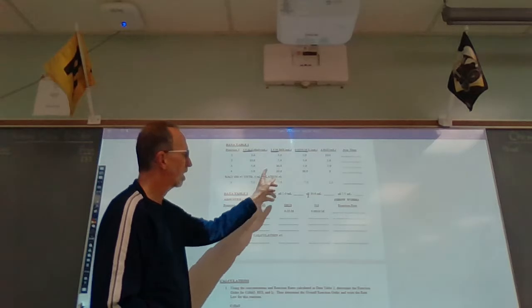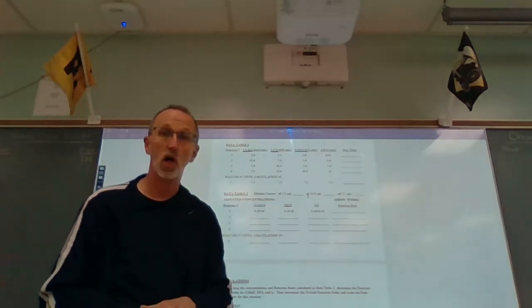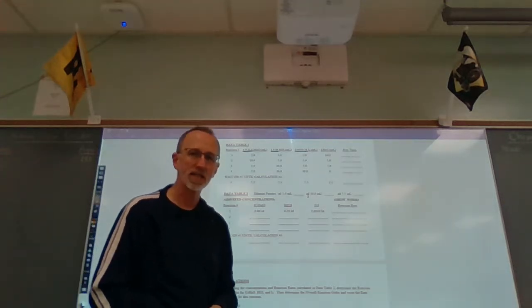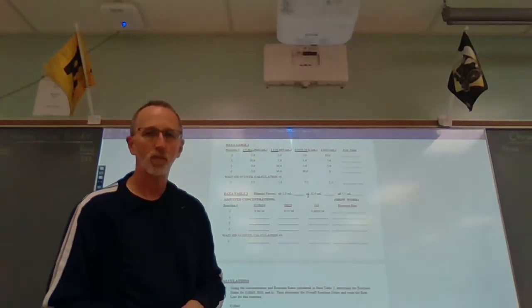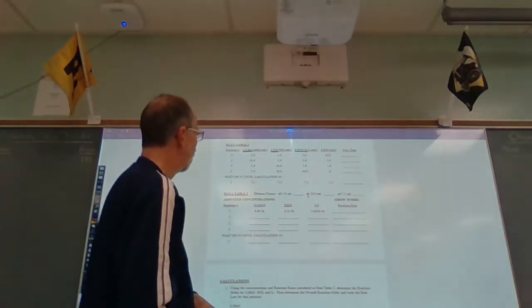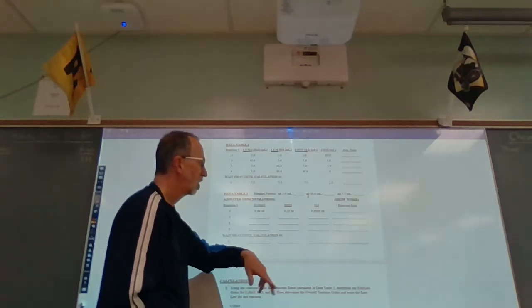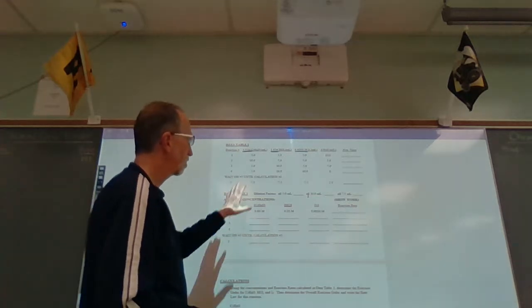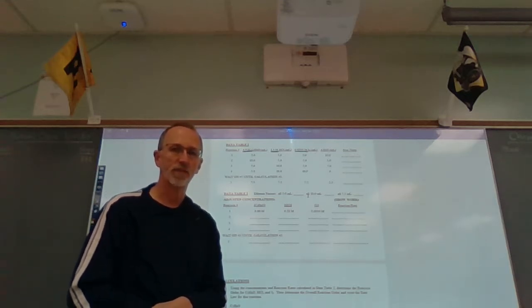We have varied the volumes of one of the reactants while keeping the other two volumes the same, and then use the appropriate amount of water to have the total volume be the same for all the experiments, which is 25 mLs. Reaction 5, same thing, 7.5 of each, only 2.5 mLs of water there to give us again our total of 25. So these are the volumes that we will measure out of each of the reactants for each of our experiments.